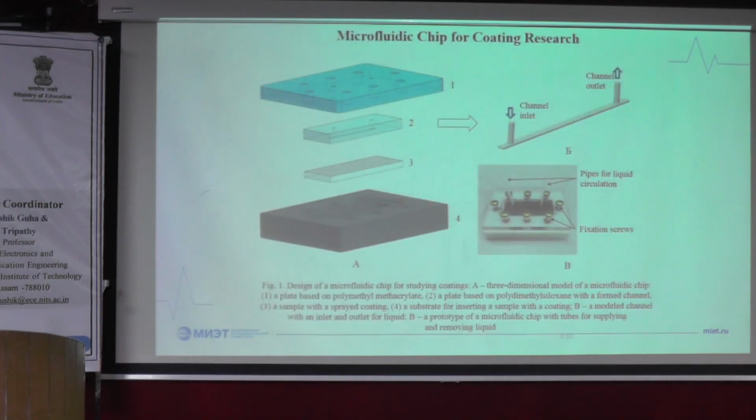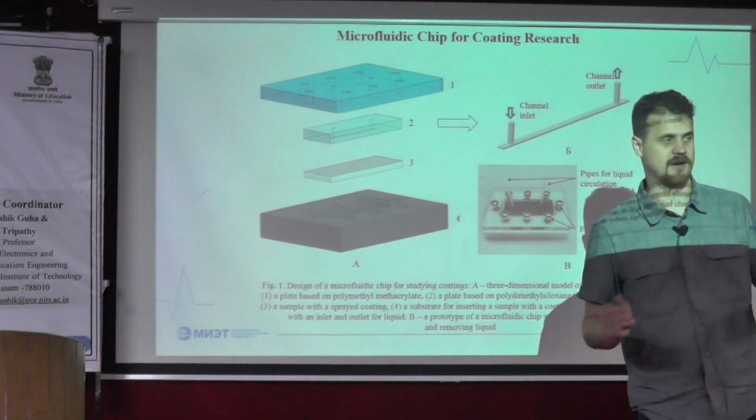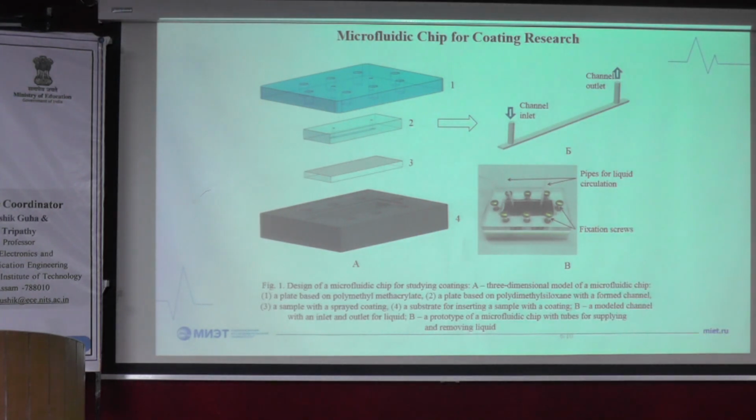And the microfluidic system is basically very desirable because it's very easy to use. We can easily change the substrate we have to use, so we don't have to use very complicated big systems like the typical pump systems where we cannot create a specific shear stress and control the shear stress at the whole peripheral surface of the apparatus.